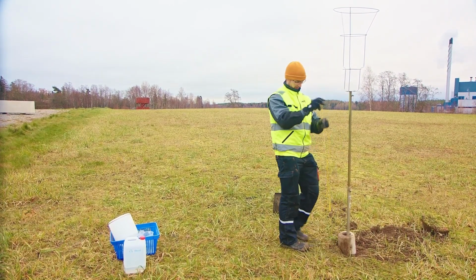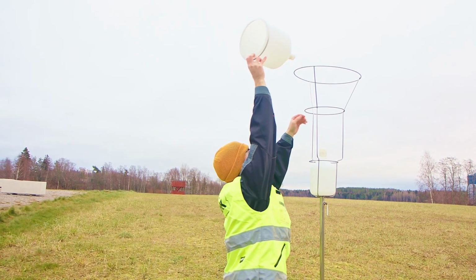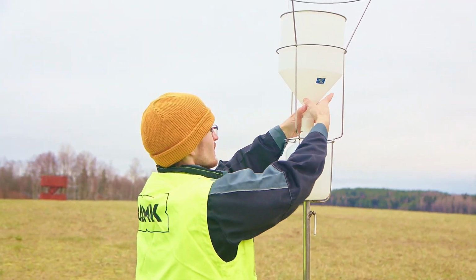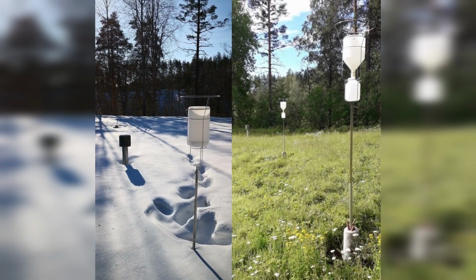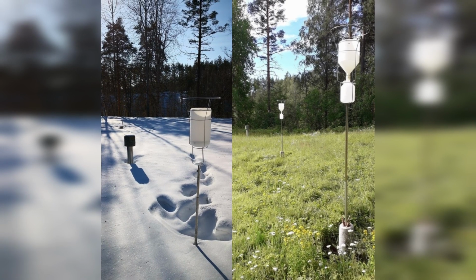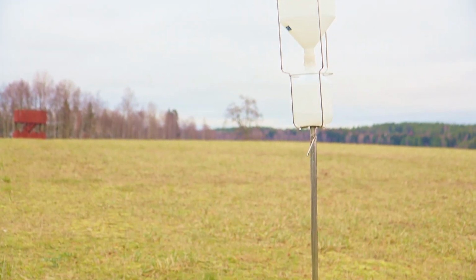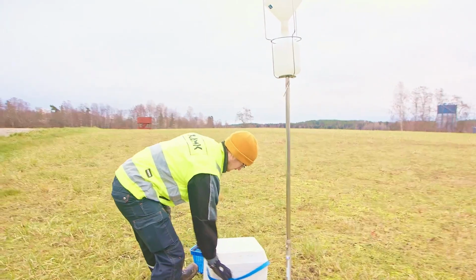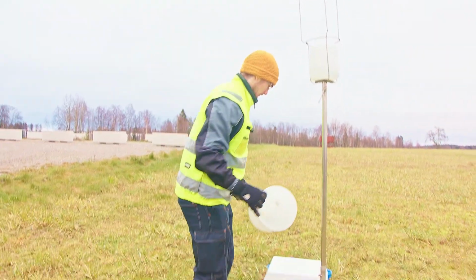The mouth of the collector should also be high enough above the ground so that the sample is not contaminated even during heavy rain. In addition, the walls of the collector should be tall enough so that none of the sample is lost due to spillage. The reliability of deposition collection can be improved with parallel collectors and a baseline collector. The baseline collector is not exposed to deposition, so it can be used to verify potential sources of error in the installation and collection process.